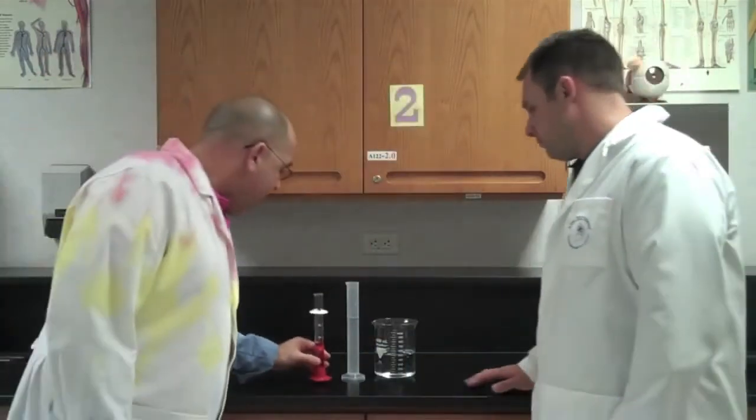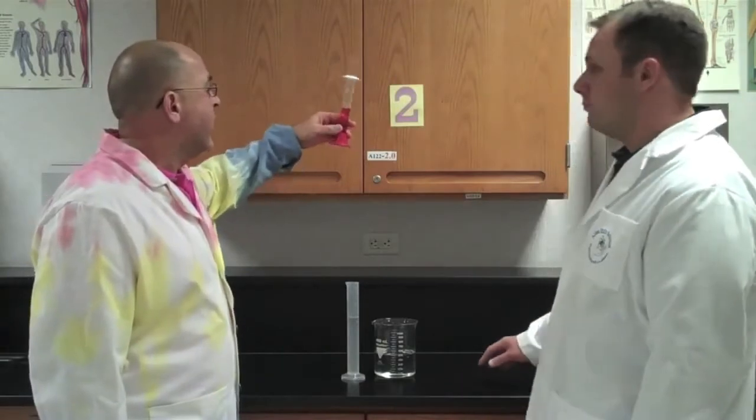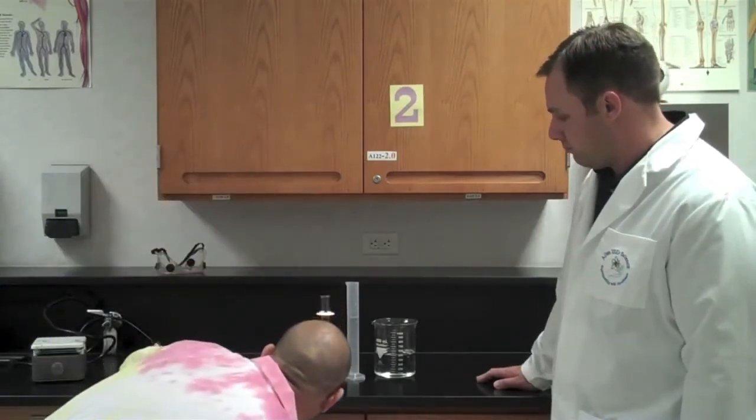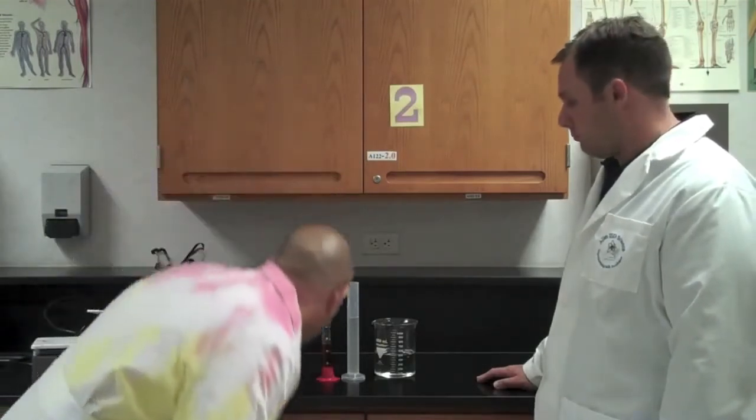But you never, ever pick up the graduated cylinder to read the volume because the water is going to tilt. So to read the volume of this, you're going to be at eye level. Now, you're going to see a curved line. It's called the meniscus. To read the correct volume, you read the bottom of the meniscus.